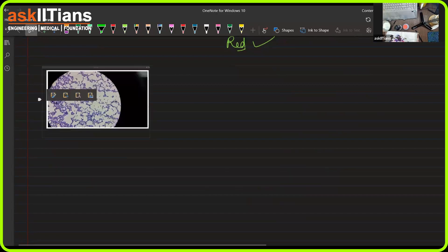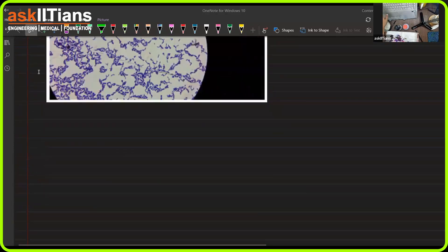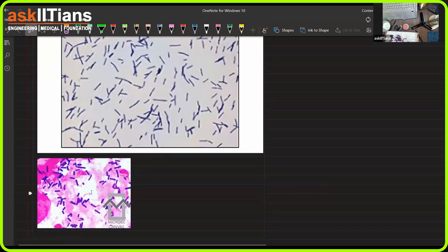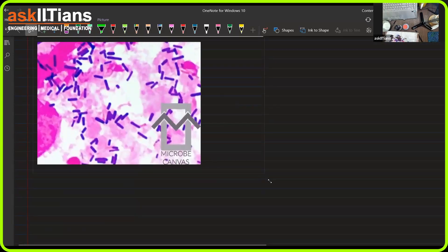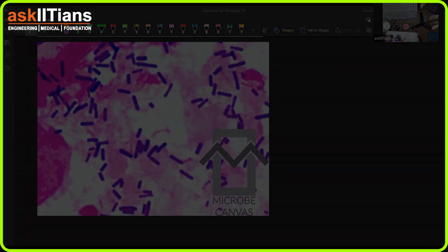Let's see the bacteria under the microscope. Is it gram positive or gram negative? Gram positive — very good, people are learning! If you look here, the safranin dye appears externally but the bacteria are blue-black in color. You can see pink color but that pink color is not inside — it is mostly gram positive. A little amount can be gram negative and there is a reason for that.